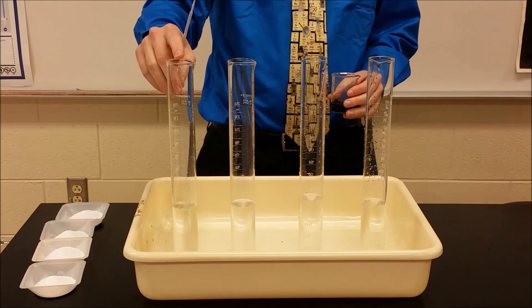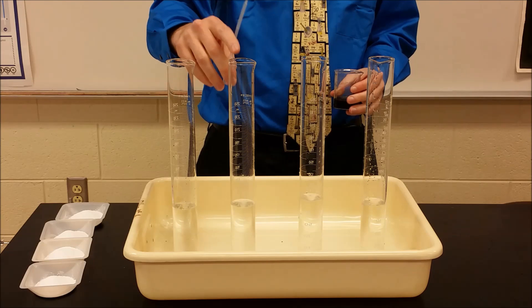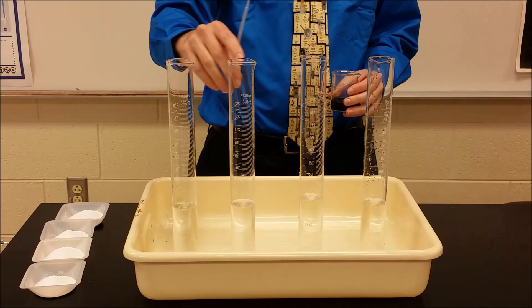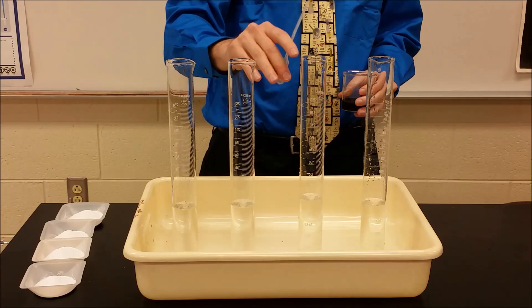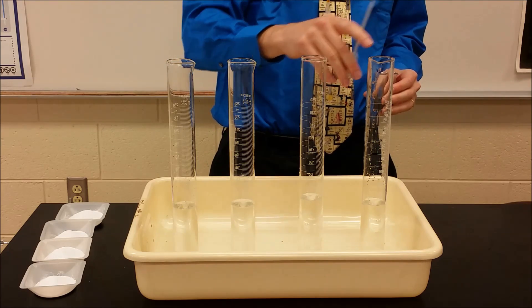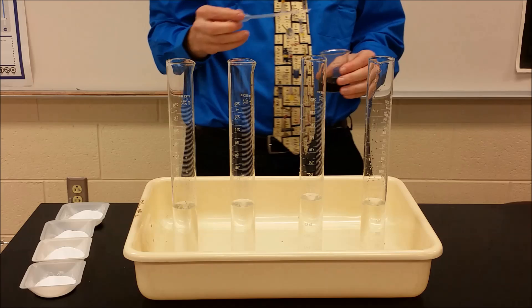This is concentrated hydrochloric acid, it's about 3 molar. This is concentrated acetic acid, it's also about 3 molar. This is dilute hydrochloric acid, about 0.03 molar. And this is dilute acetic acid, also about 0.03 molar.